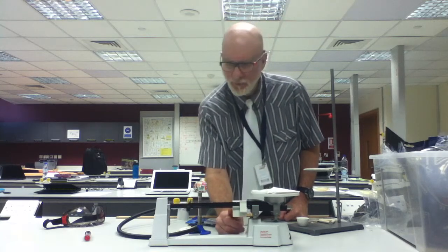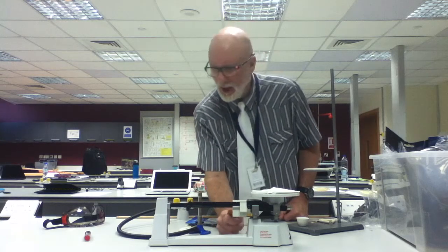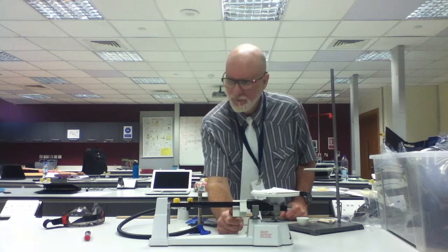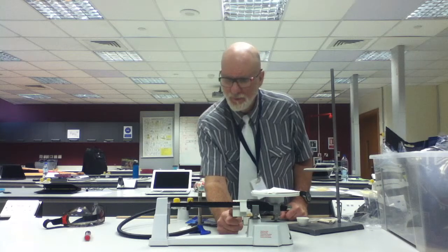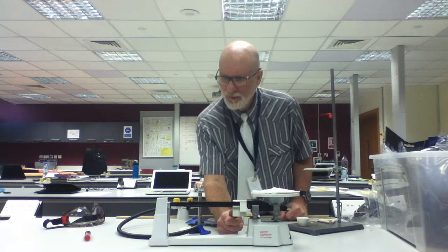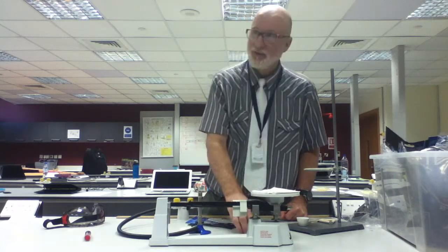I should redo that. It takes time. You've got to make sure it's exactly on the line. See why people don't like to use triple beam balances? But they're extremely accurate.